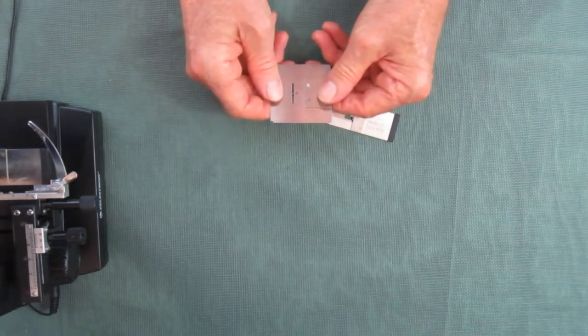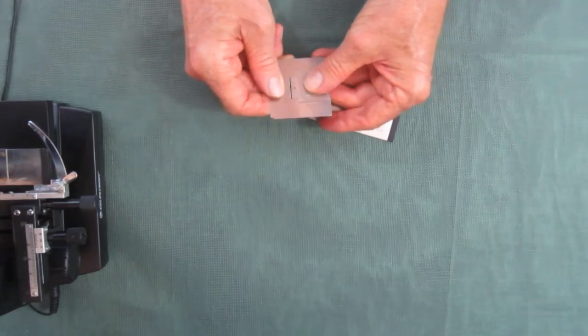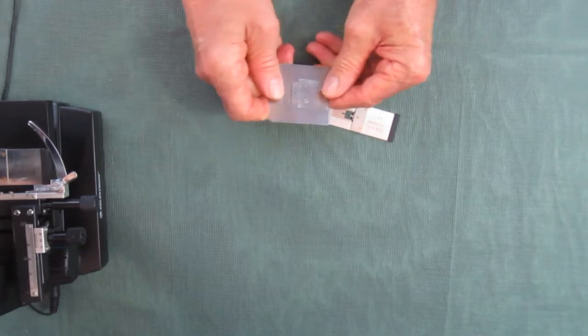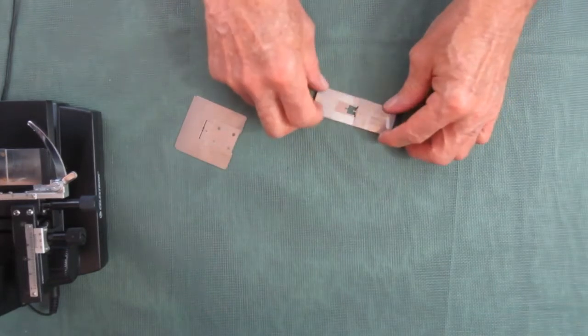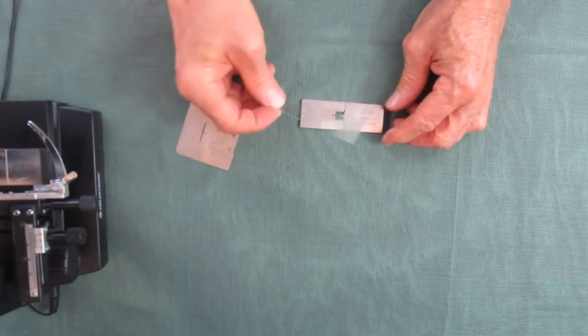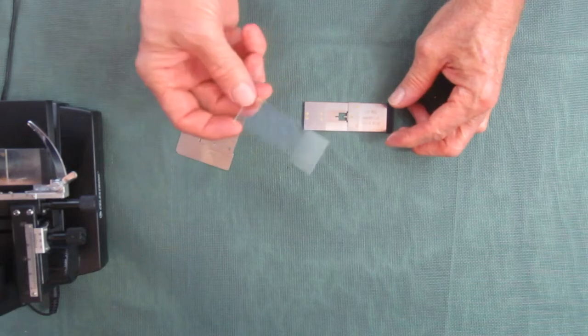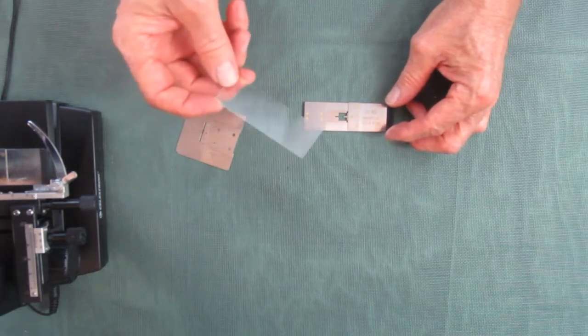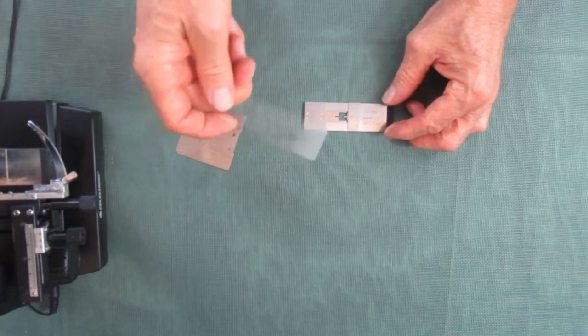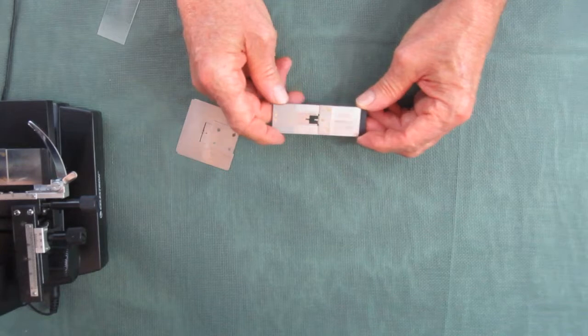Now the new slides, I redesigned them so they are more the shape of a regular glass slide. So any microscope that's set up to use a typical one by three glass slide is very easy to mount these on. They're a little thicker because of the guides.